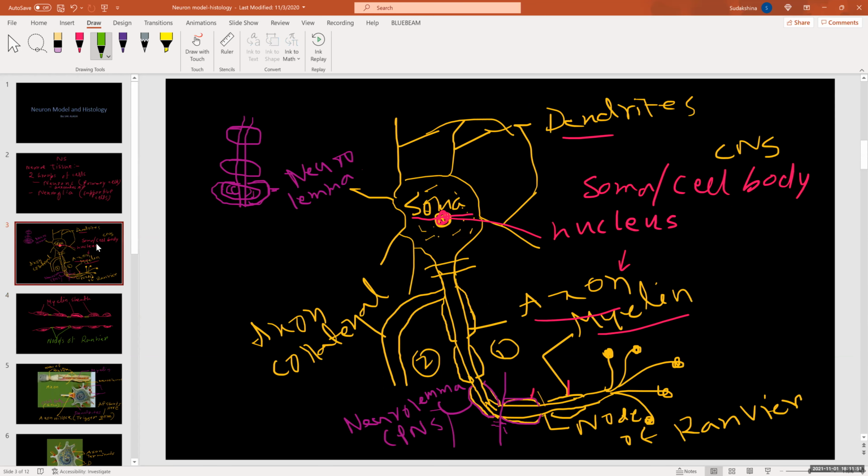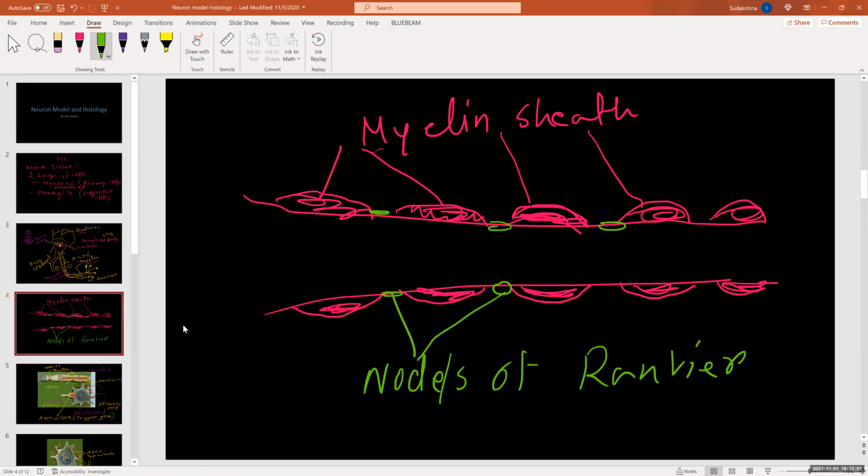When we look at the end of the axon, we already know, axon terminal. Right there, as you can see, those bulges toward the end, that's what the axon will give rise to. It will give rise to axon terminals. So axon terminal.